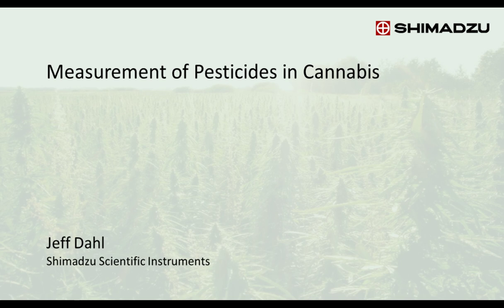Hello and welcome to this presentation. It's my pleasure to present for you. The topic of today's talk is measuring pesticides in cannabis. The techniques that we're going to talk about are industry standard for measuring pesticides in food and vegetables, and now we're applying those same techniques with the appropriate modifications to cannabis.